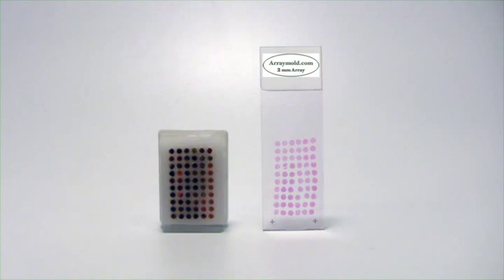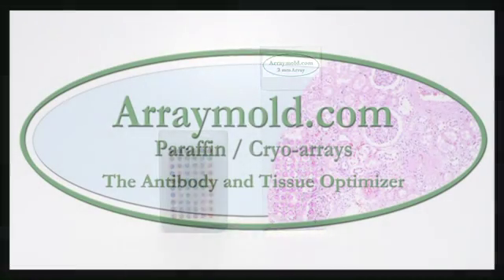I hope the techniques that I've showed you here will help you to create tissue microarrays. And thanks for choosing the array mold.